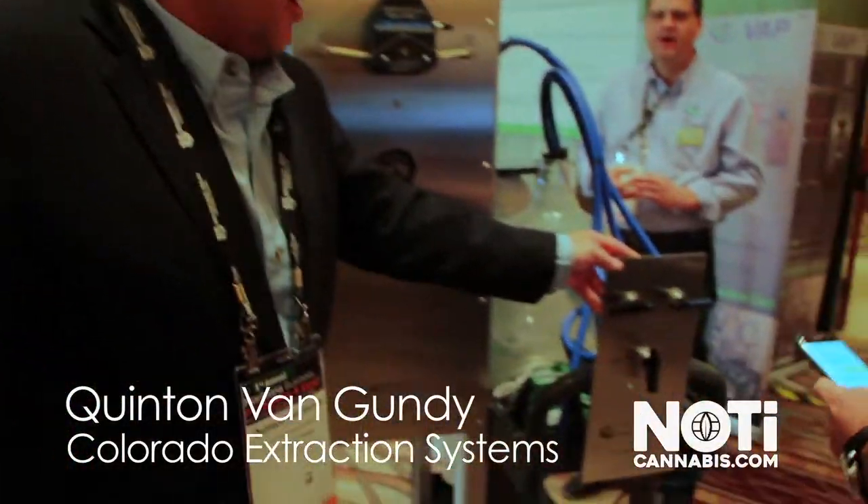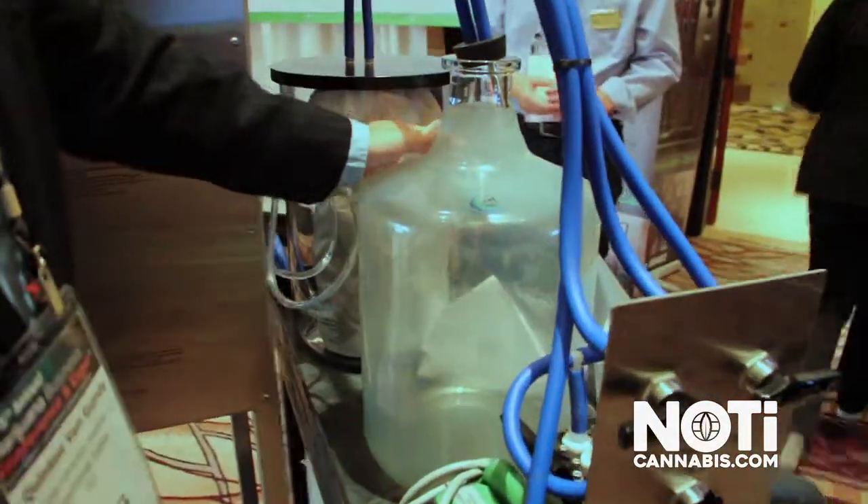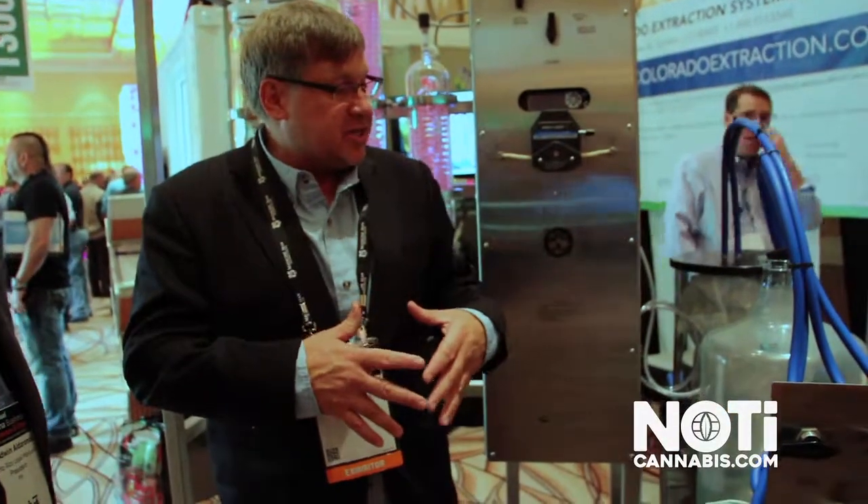So we have two parts. We have the extraction cart right here. The extraction cart is where you put the plant matter inside the bag. You then bring the distillate from the spray vap system into the bag — it marries with that and the alcohol will dissolve out all the cannabinoids. You then run through the filtration system and go into the tincture bottle.